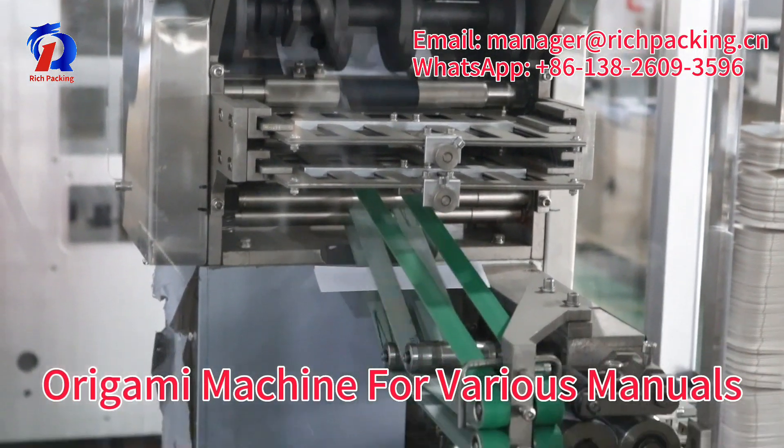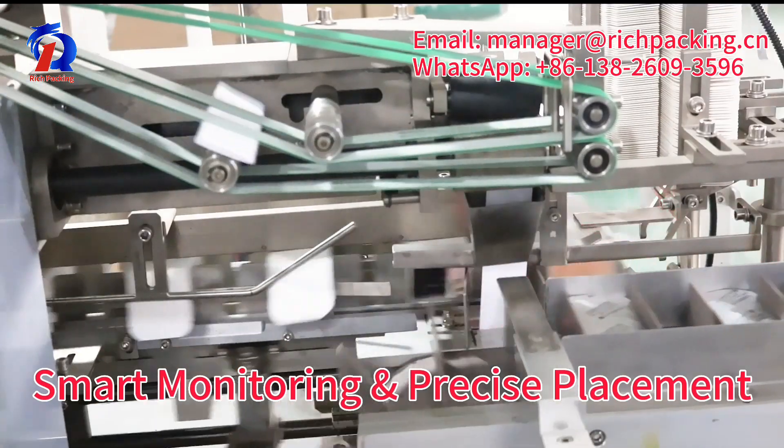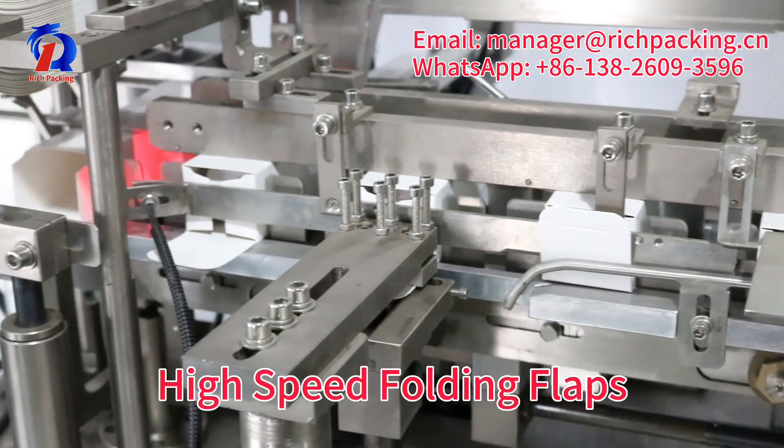Origami machine suitable for a variety of manuals. Smart monitoring and precise placement. High-speed folding flaps.